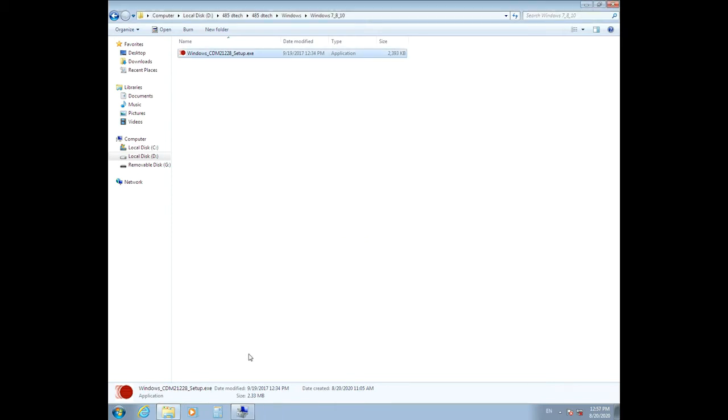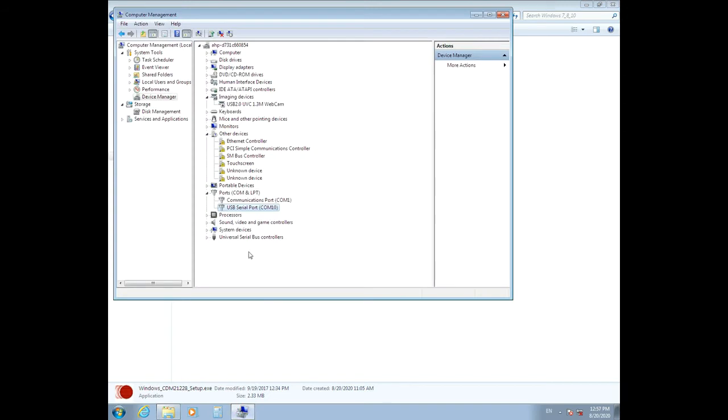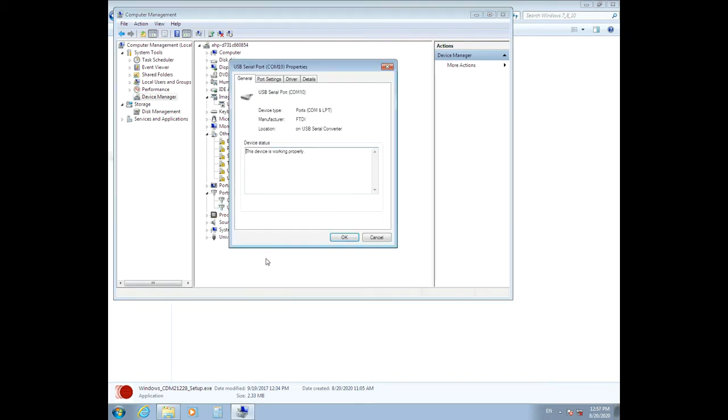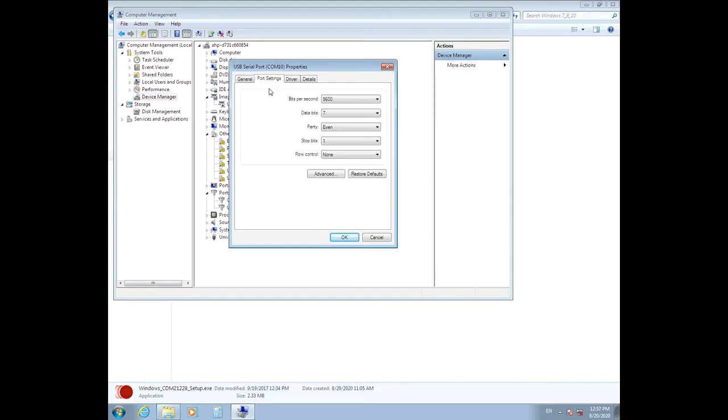After that, from Device Manager, right-click on USB Serial Port and click Properties. A window will open. Then from the Port Settings tab, adjust the parameters to the values you see here.